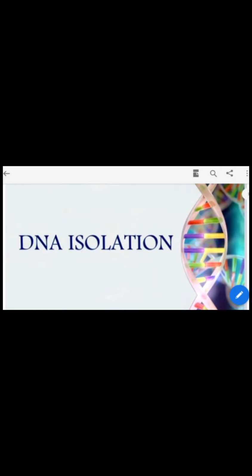The chapter name is DNA isolation. All the students who requested that I show how DNA extraction is done, basically the theoretical part, it will be helpful for you. That's why I have come with this video on how you will extract the DNA from the plant cell as well as the animal cell. But in this practical in biology subject, we have collected from the plant cell. So let's go ahead to the class.